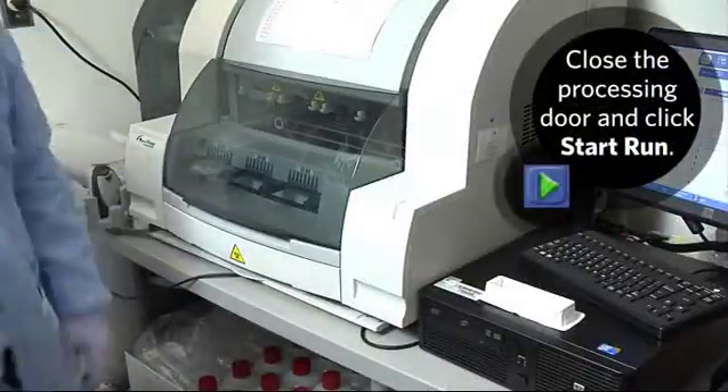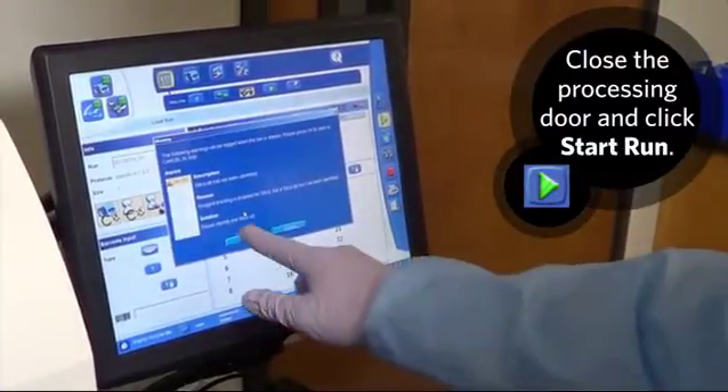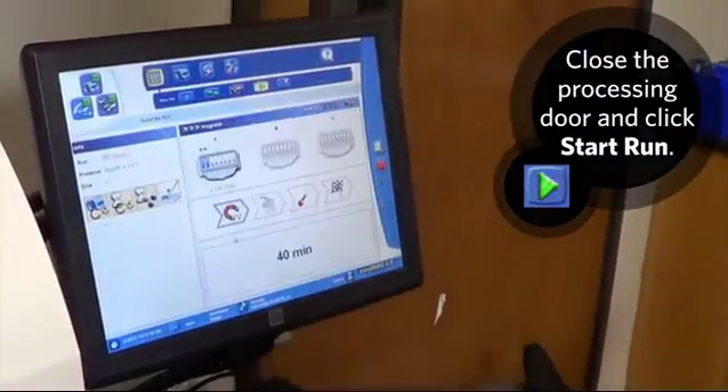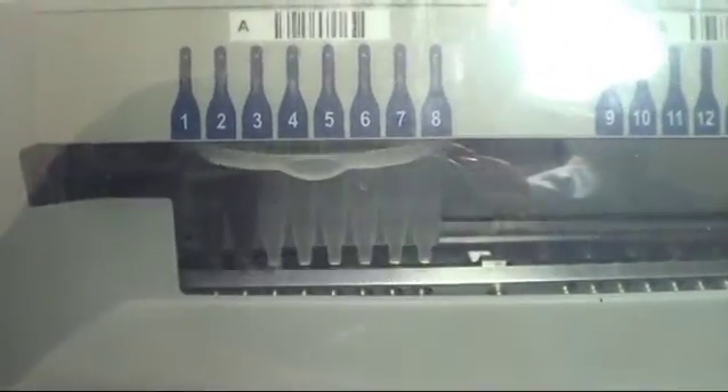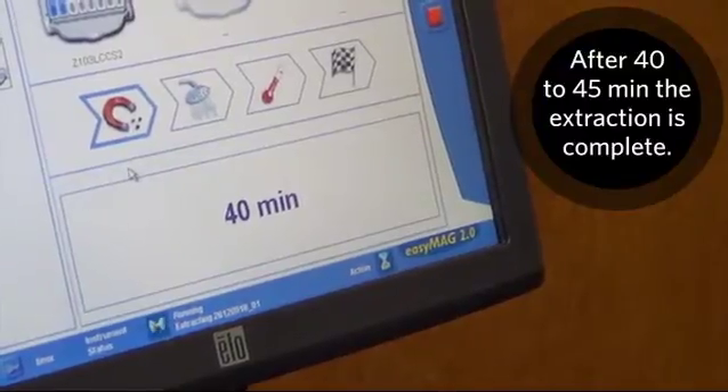Close the processing door and click Start Run. After 40 to 45 minutes, the extraction is complete.